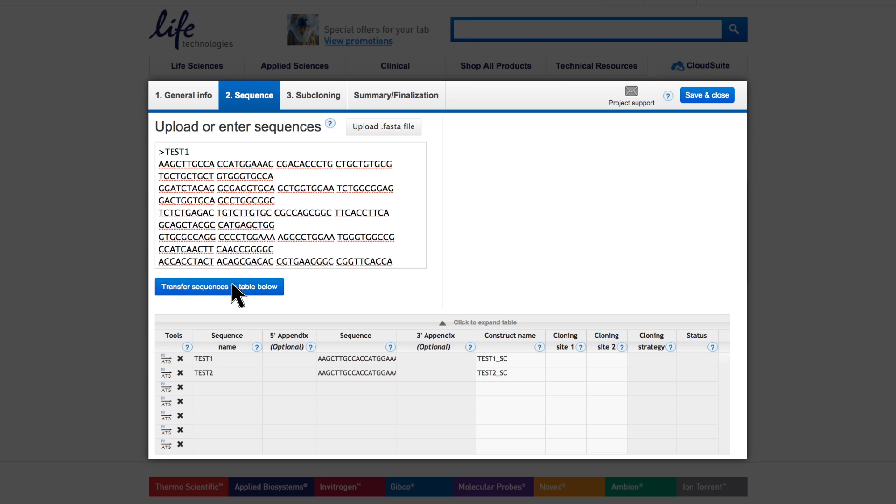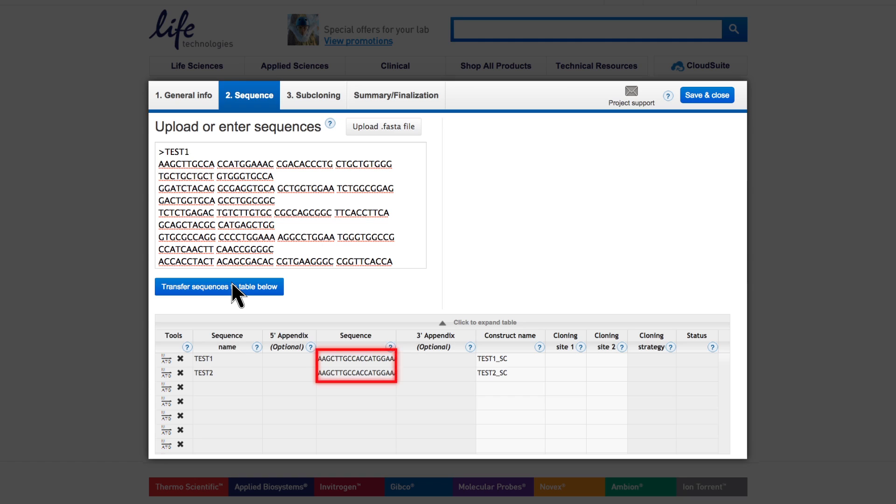Use the 5' and 3' appendix fields to add your required UTRs or flanking cloning sites. In case of a wild-type DNA sequence, you may attach the UTRs or cloning sites directly to the sequence. Either way, cloning sites are always mandatory if you want to do subcloning.